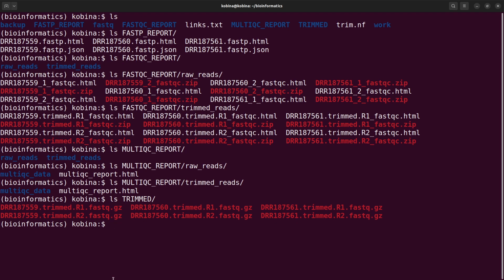Okay, of course, initially you have to make sure you put in the right commands, you put in the scripts, everything. And once everything is done, you can always reuse the scripts on different data sets as well. That's the beauty of Nextflow. So once you have it, it's just a matter of calling Nextflow like this one, and then specifying where your reads are. Also I would advise that you specify the absolute paths for the reads. It's always important to do that. Here I use fastq because I am already in that current directory, but ideally you should try to use the absolute paths.